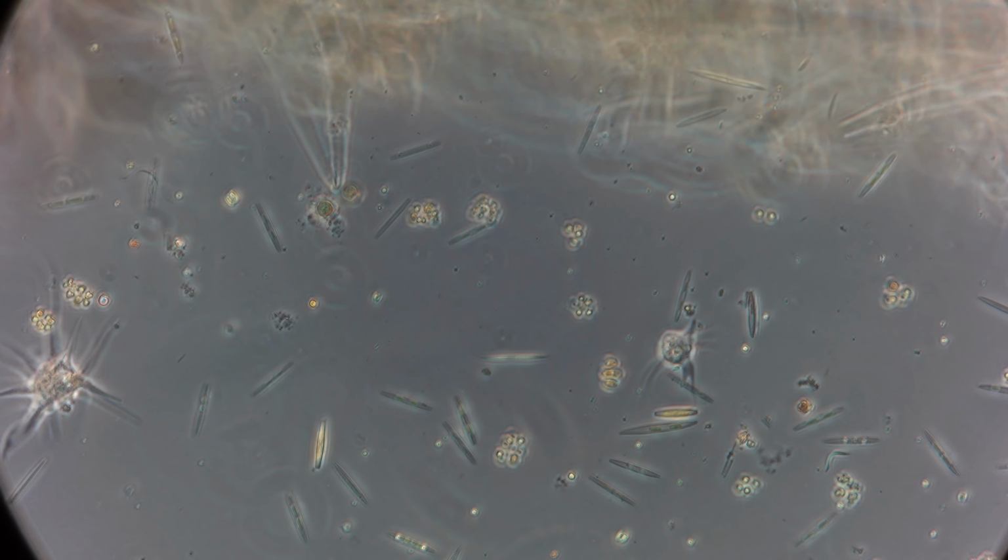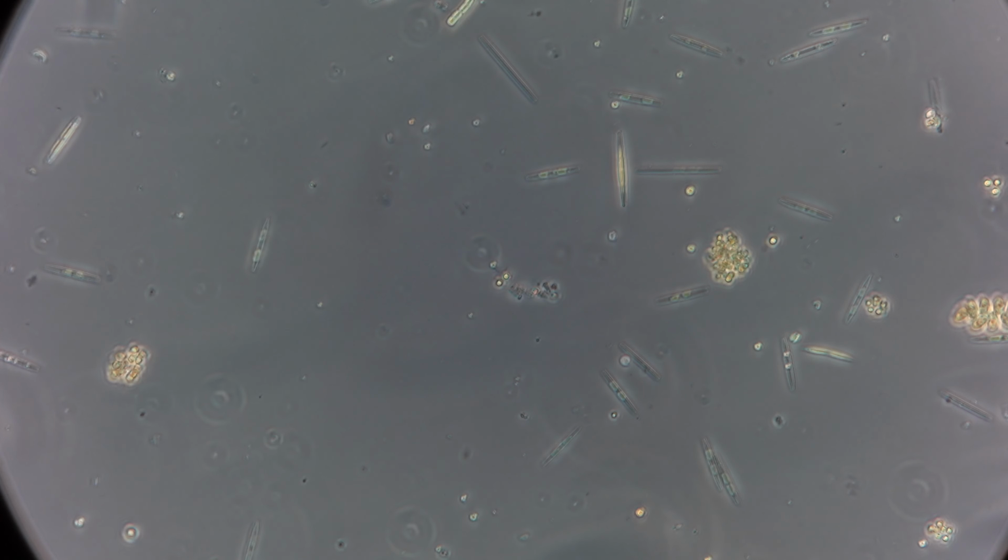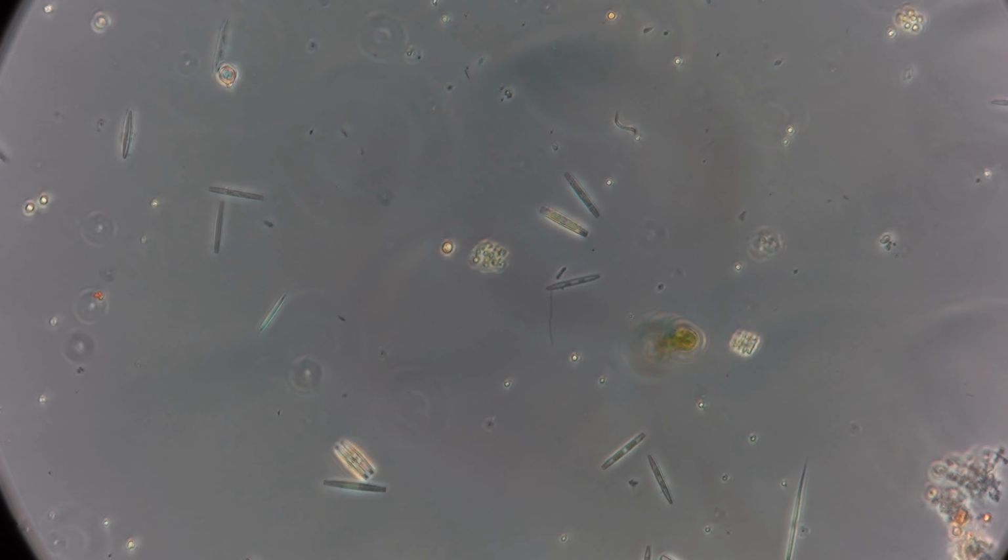Oh my God, there's so many amoebas! It's so exciting. A little higher magnification. There's one of those little algae guys.